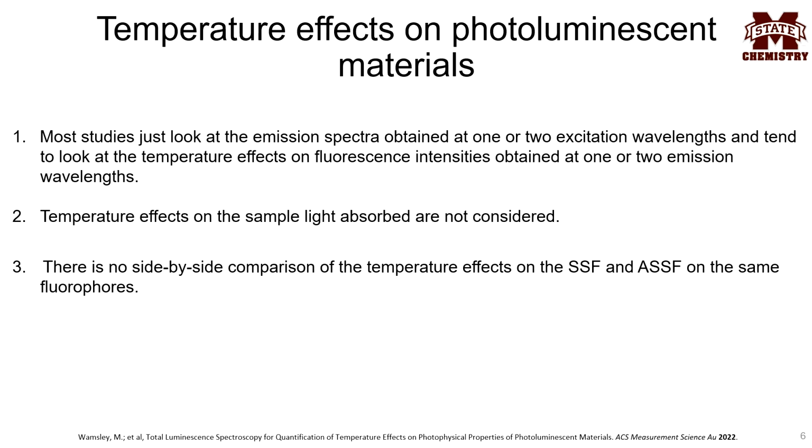Many studies have focused on the temperature effects on Stokes shifted fluorescence, but only a few studies have looked at how temperature affects the anti-Stokes shifted fluorescence. There is no side-by-side comparison of the temperature effects on the Stokes shifted fluorescence and anti-Stokes shifted fluorescence on the same fluorophores.